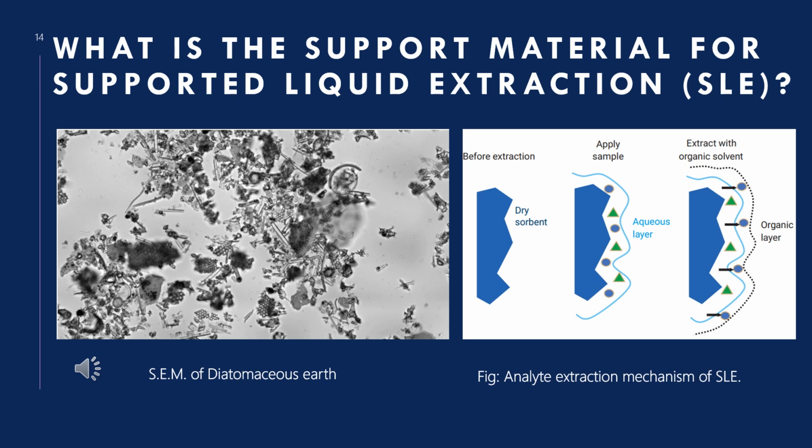Like the liquid extraction process, this also has 2 liquid phases that interact with each other. Phase 1 is formed when the aqueous solution like water, plasma, serum, etc. is loaded and free to flow via capillary action for a period of time, and this enables the absorption of the water on the surface of the diatomaceous earth.